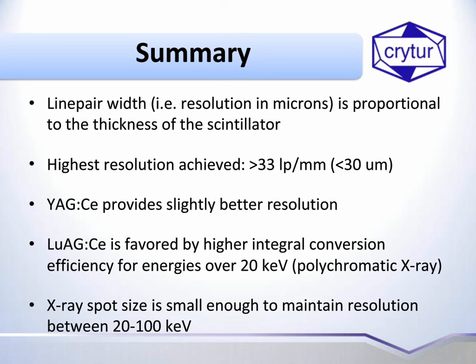Yeah, so it's a good question again. With the scintillator, you don't really lose much, because you're collecting. You do have the danger of two optical surfaces, so you have light being lost. If you get a mismatch between fiber plates, then you can get effectively a loss there. But as Yuri covered in his report on the testing, they actually did use scintillator fiber onto the plate. I didn't see a loss. It maintained the resolution. You may get a slight loss in the throughput. This is one of the reasons why we specifically design with few fibers, so we have as few surfaces as possible, because one of the aspects is to make sure we don't compromise the throughput. I don't know if Yuri wants to add on to it.